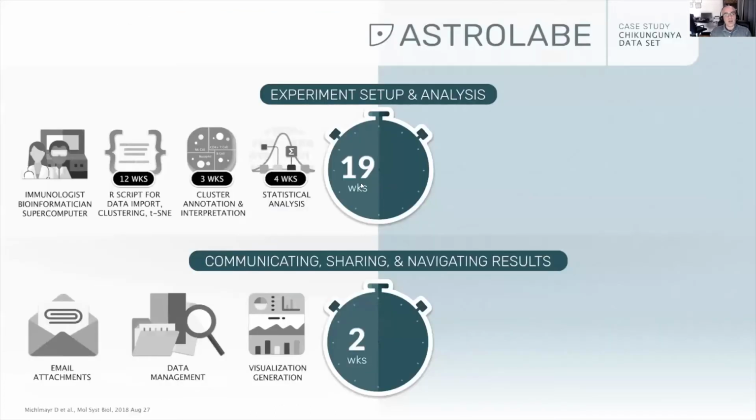And another element to factor in here is the amount of time that analysis can take. Even if you know what you're doing, this is a case study that we've done with Mount Sinai Hospital. And here we're seeing a project that was analyzed there about 3 years ago. And the total analysis time for this project was about 20 weeks.